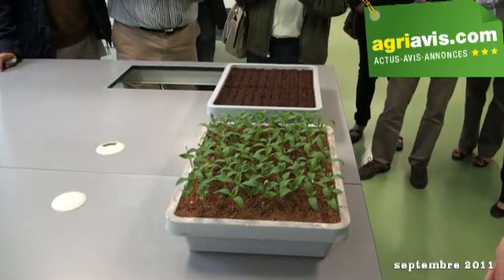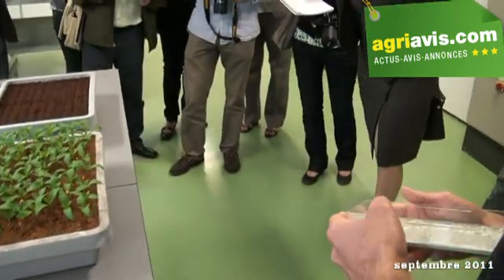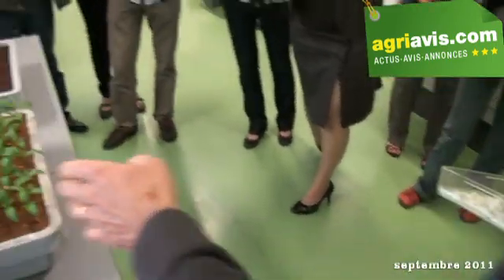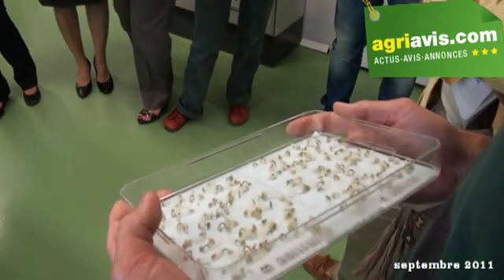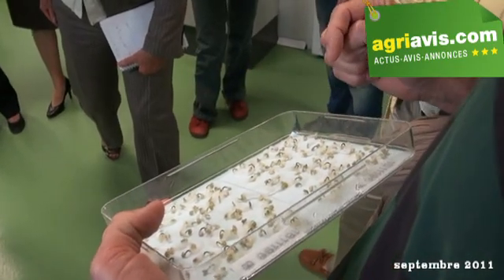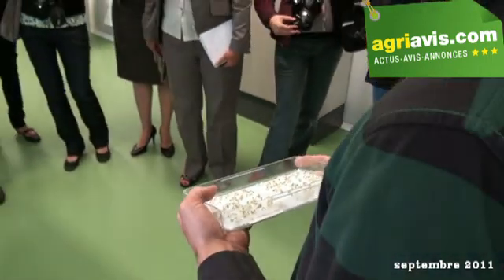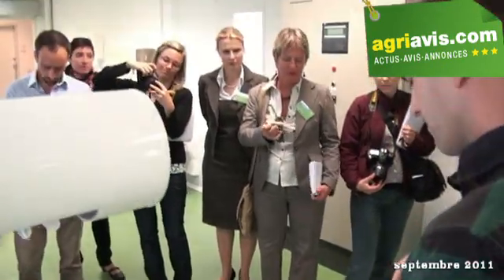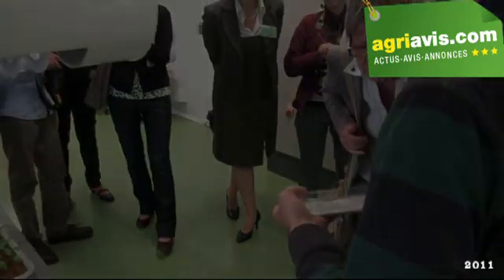To compare this with germination — this is our germination test. Here are also peppers, but then for germination. A lot of these tests we do on this medium; it's a blotter, we call it — it's a filter paper. This is a little bit too early a stage, but normally in the germination test you can evaluate the whole plant.